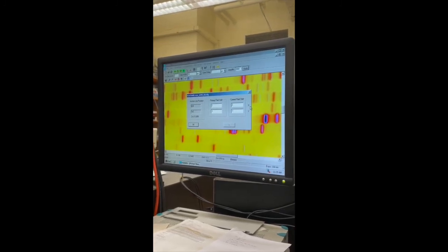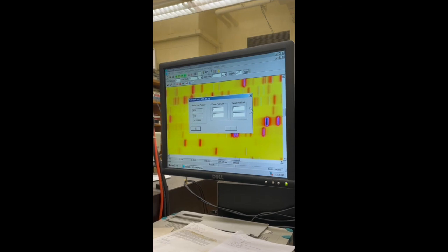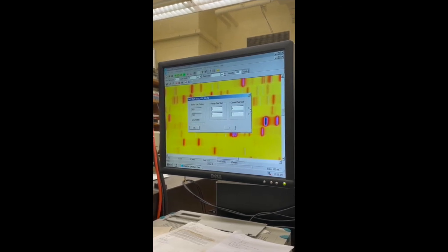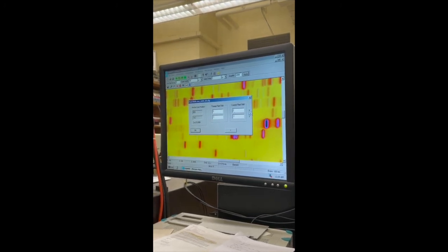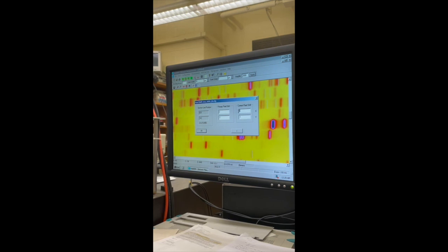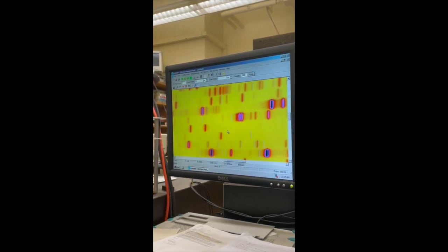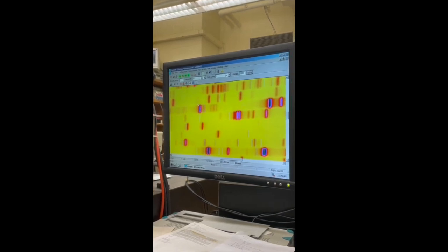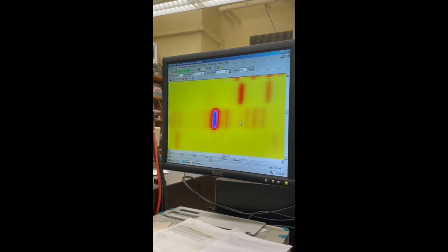And it's a really good idea to do this at the beginning of the day before you accumulate a bunch of data. So if you wanted to really zoom in, that would tell you literally how many pixels over you want to shift. Why don't we go ahead and take a look at that just to make sure. So if you click out of this window, because you can't really see the pixels here, but zoom in on, yeah, that one right there. Let's zoom in on that even closer. Look, now you can actually see the individual pixels.